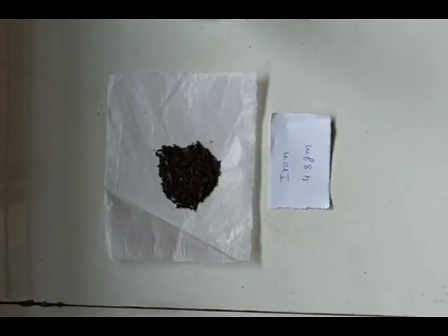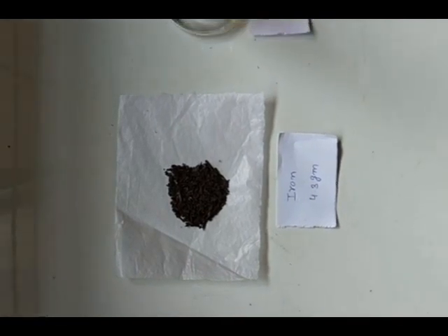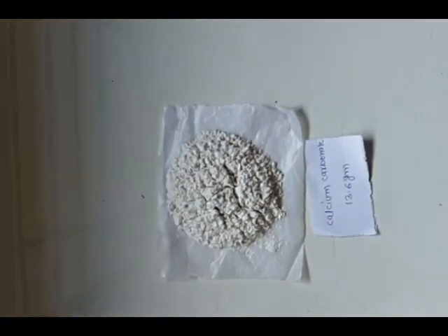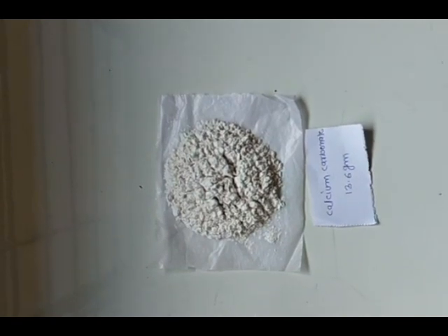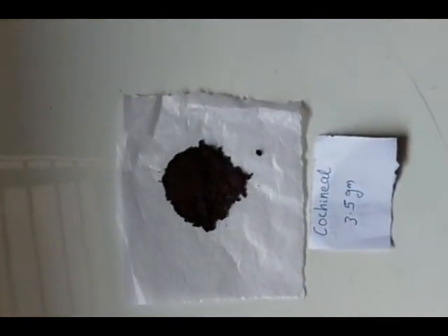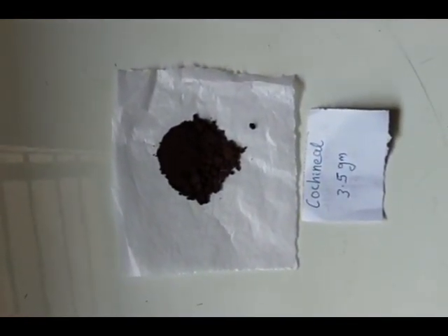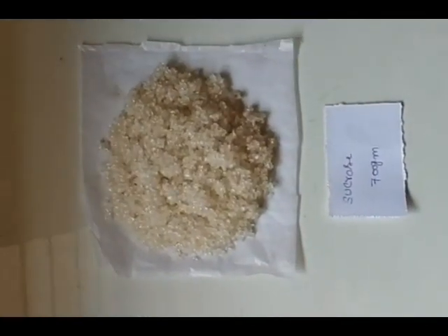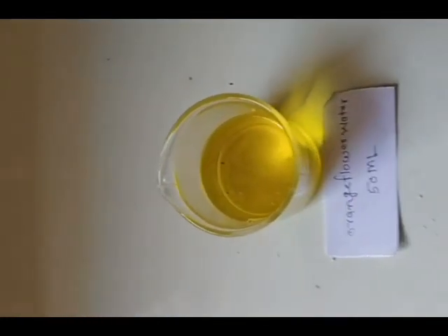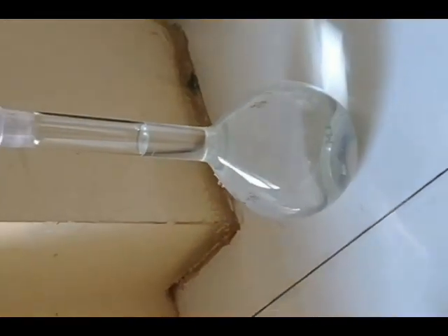The quantities used for this practical are: iron 4.3 grams, phosphoric acid 48 ml, calcium carbonate 13.6 grams, potassium bicarbonate 1 gram, sodium phosphate 1 gram, cochineal for coloring 3.5 grams, sucrose 700 grams, and orange flavor oil or water, with distilled water to make up the volume to 1000 ml.